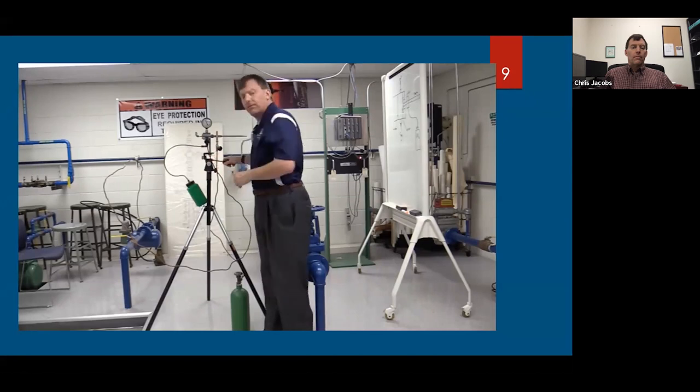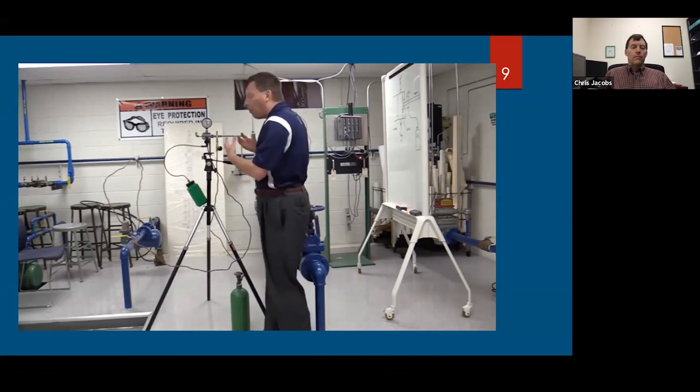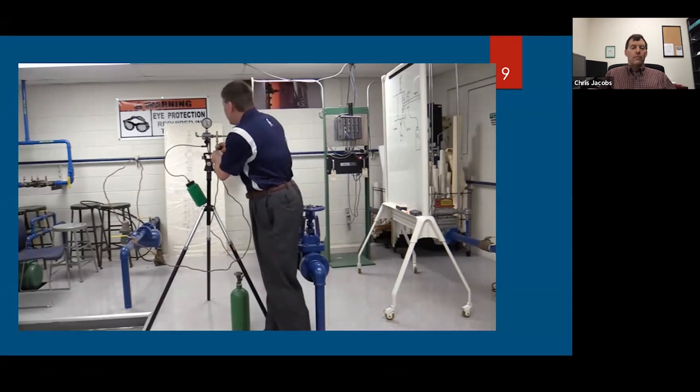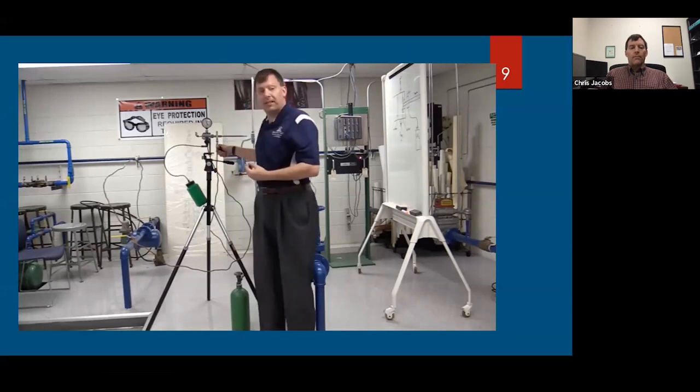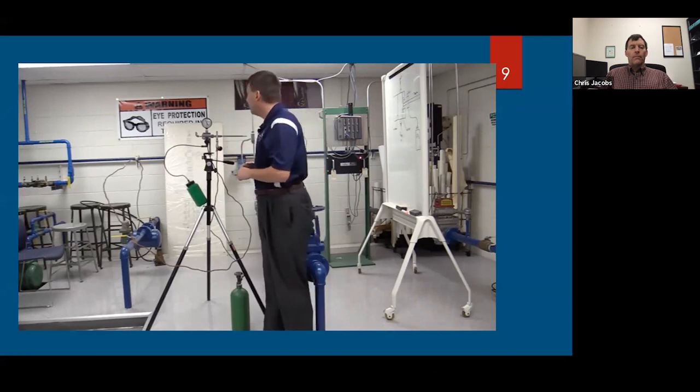So the second droplets are gone. The temperature is now 60 degrees. So now what I'll do is let it warm up a little more, and then I will do it again. Okay, I just started seeing droplets, and the temperature is 58 degrees. So again, I will shut it off and let it warm up again.